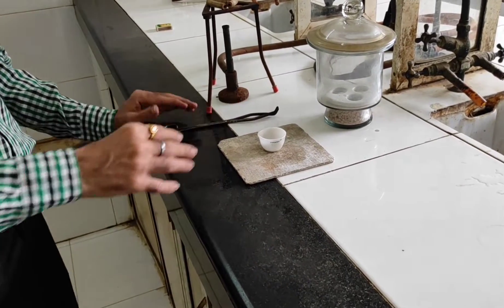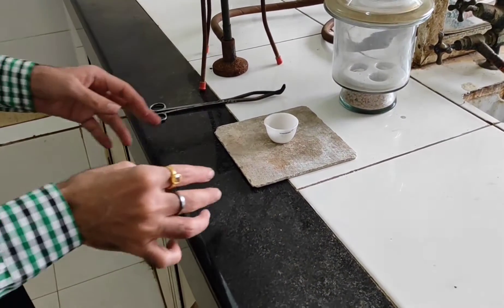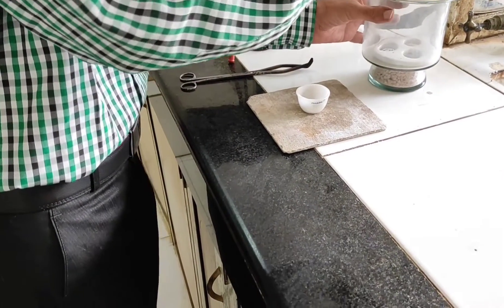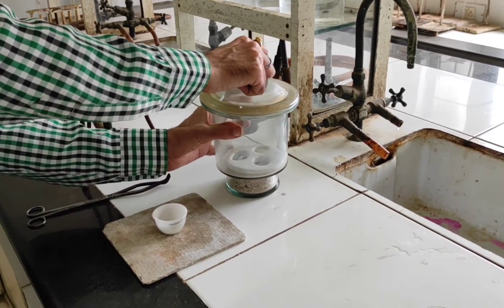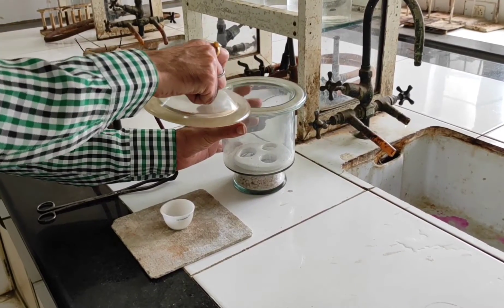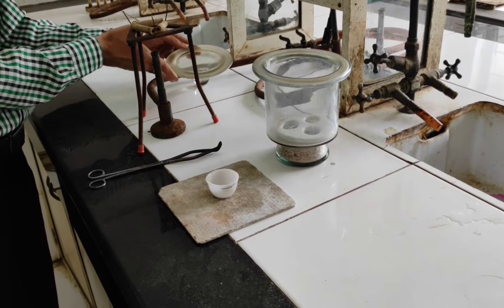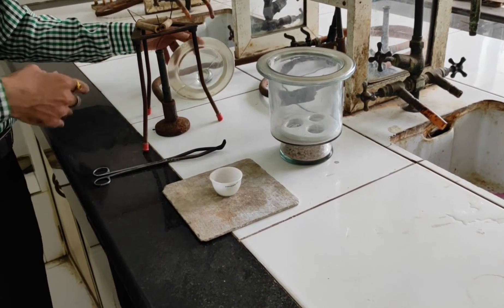Now, this has been kept on the asbestos sheet for around 5 to 10 minutes. Now, what we do is we make use of a desiccator. I told you in my previous video also how to open it. Don't lift it, you just slide it.